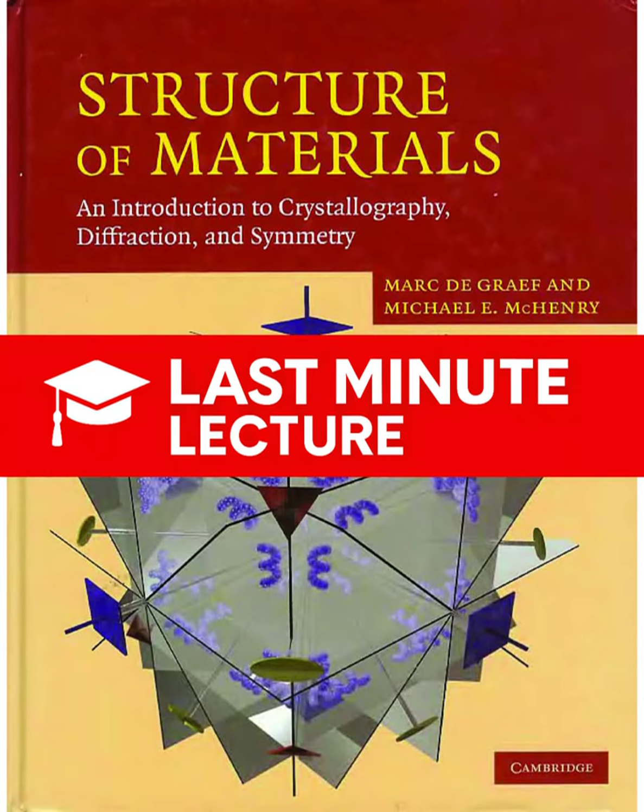Yes, but here's the trick. The sphere is centered not at the reciprocal lattice origin O, but at the starting point C of the vector k. The endpoint of k is placed exactly on the reciprocal lattice origin O. So the sphere is positioned relative to the incoming beam, and the crystal's reciprocal lattice points are fixed.